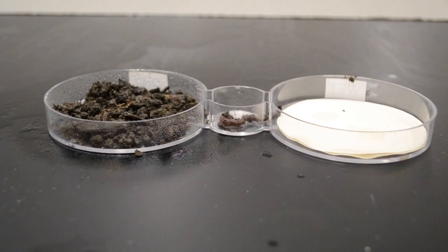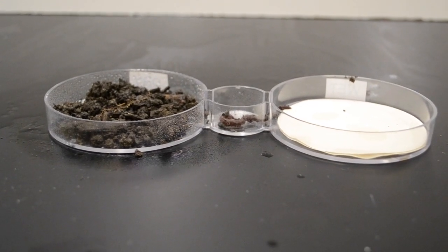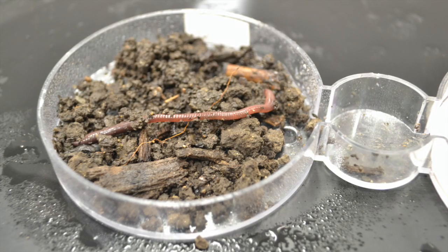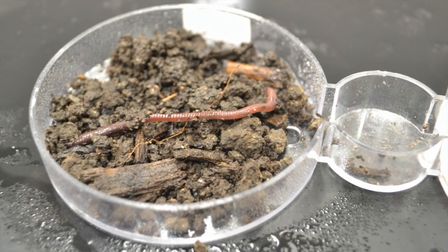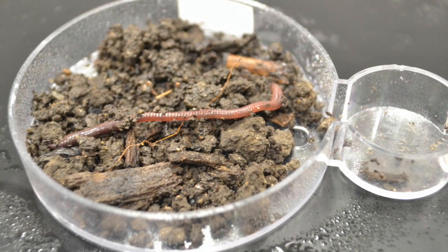Okay, I'm actually going to pause this and I'm going to take a picture in 10 minutes to see where the worm went. Maybe that'll work a little better if we give it more time. Again, I didn't want us to watch that for 10 minutes, so I took a picture of where the worm ended up. And that concludes our 4 experiments.